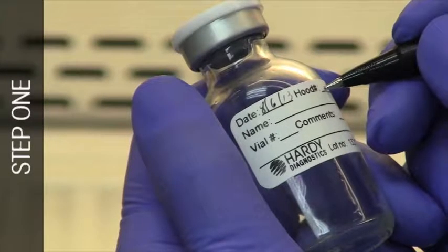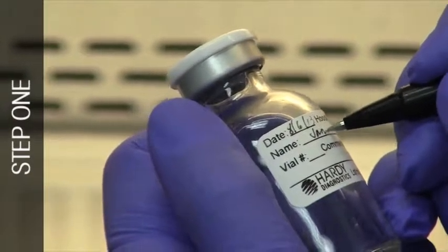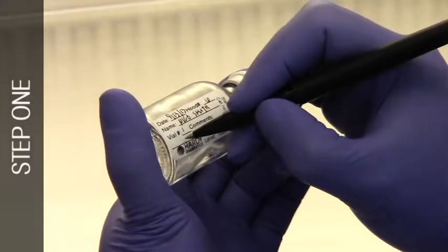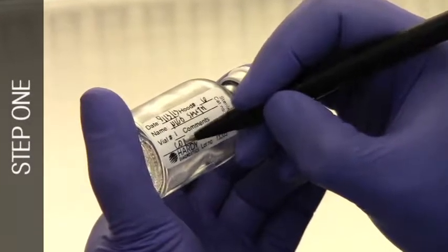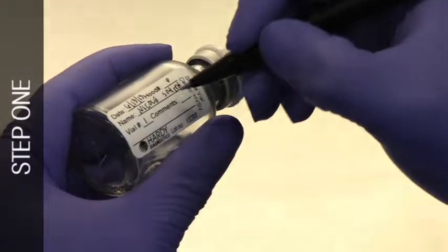Label the empty sterile 20 ml vials with the date the challenge was performed and the initials of the person performing the procedure. Label three of the vials Control-1, Control-2, and Control-3. Label the remaining six vials with the numbers 1 through 6.